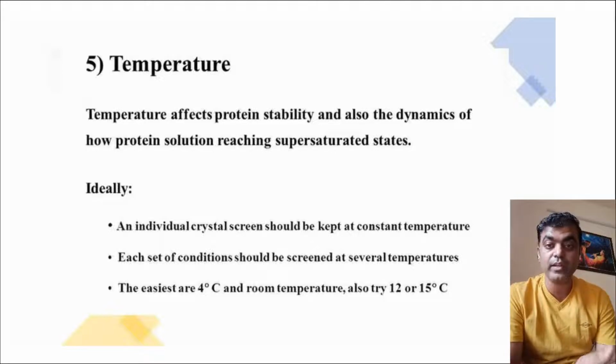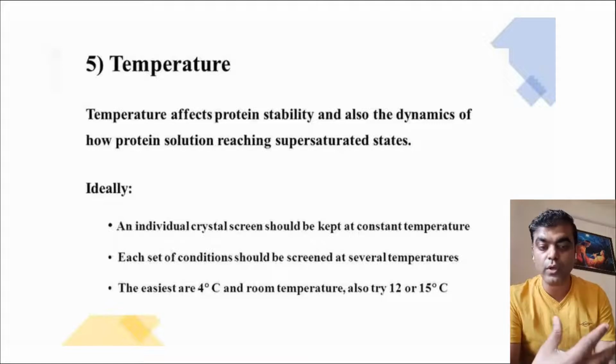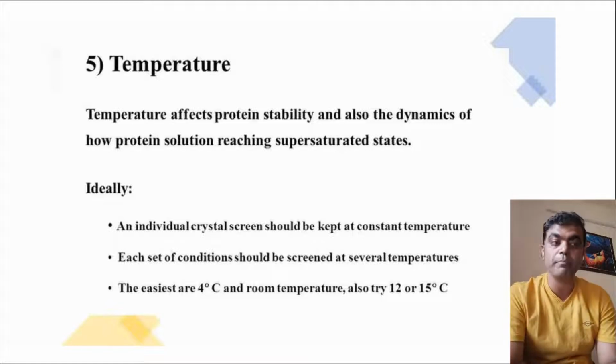Yes, you are hearing it right. It may take even 1 or 2 years to have crystallization complete. So you cannot predict the timing, and the smaller the fluctuations your entire setup experiences, the better it is.